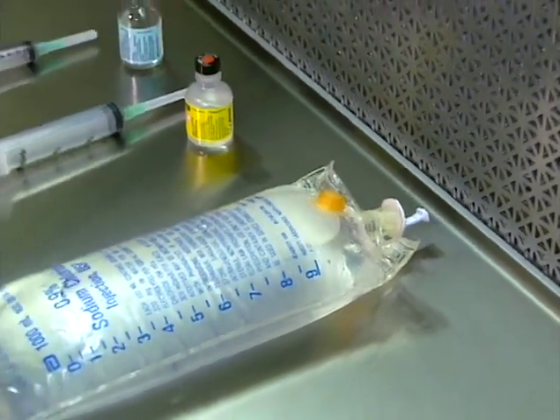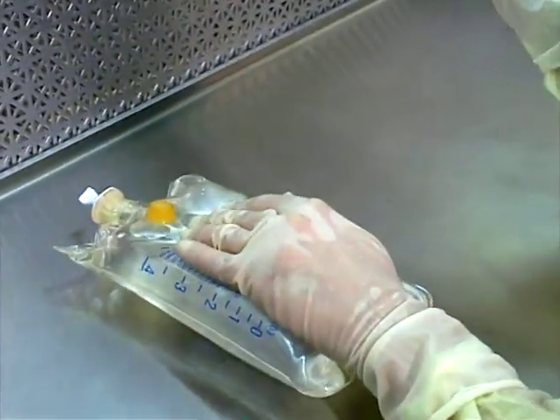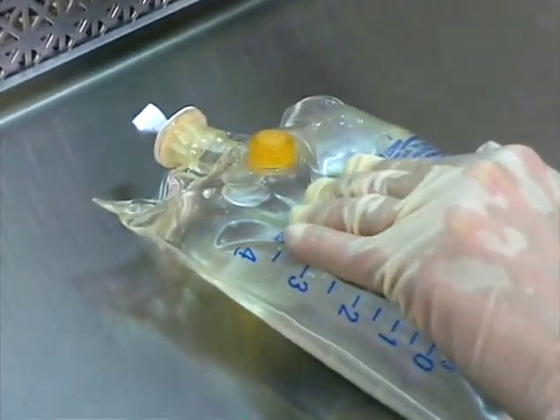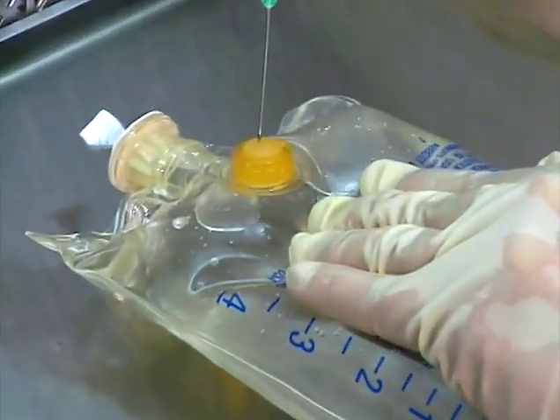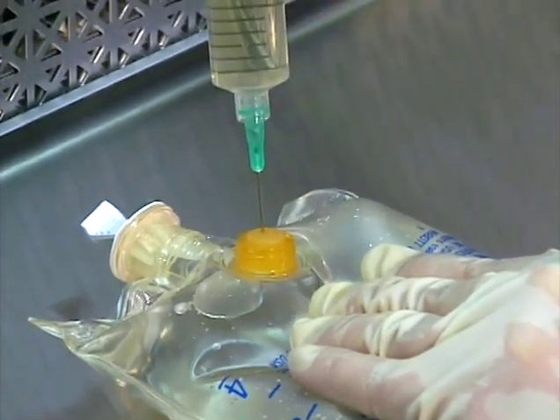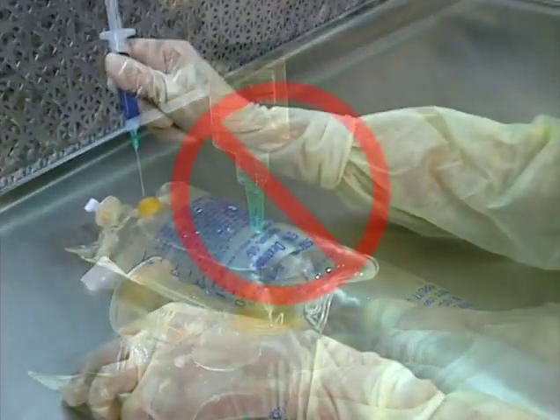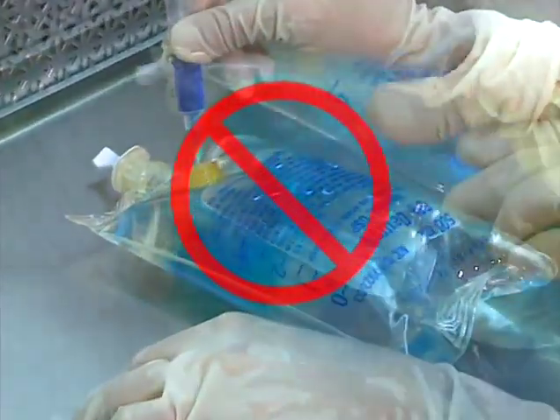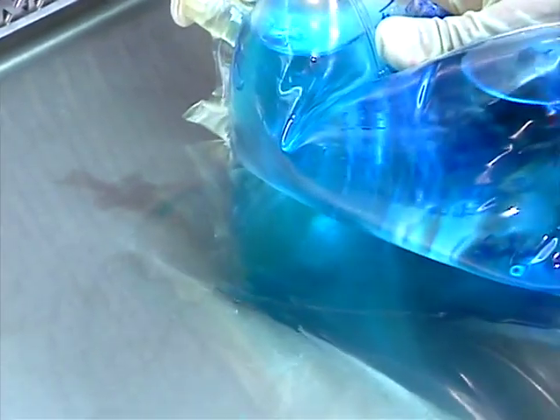Care must be exercised to prevent a puncture of the rear side of the bag when injecting additives. This is accomplished by applying firm pressure on the downstream half of the bag to distend the belly port area, thus keeping the port elevated, preventing the needle from contacting the rear side of the bag. Be sure to mix thoroughly after each addition.